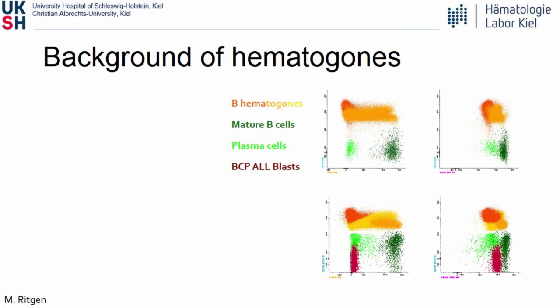So identify normal cells in your regenerating blood or bone marrow sample, and all cells you cannot identify as normal are most likely blasts. But to do so, you have to analyze normal bone marrow to have your own reference, if you develop your own assay, your own reference, how normal cells look at different treatment time points.